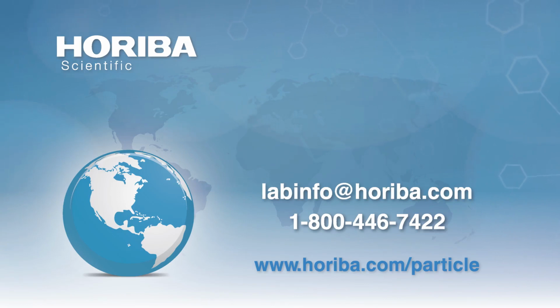Thank you. And that kind of takes us to this next question. How frequently do you have to clean the instrument? And I'm assuming this is for laser diffraction. Well, I guess there are probably two answers. One would be the wet and one would be the dry. With either one of them, you actually have a built-in way of analyzing whether you cleaned up properly or not.